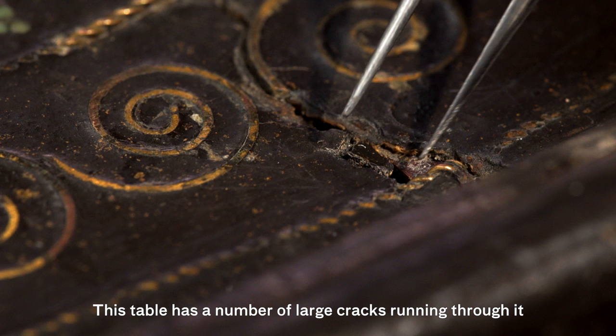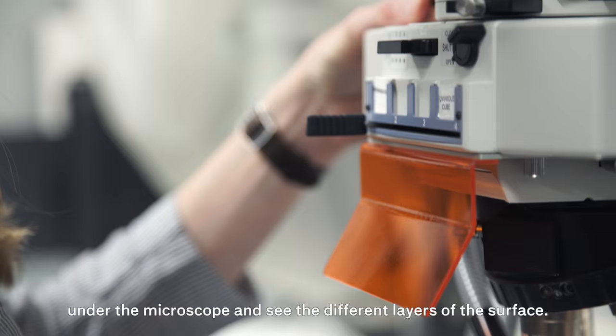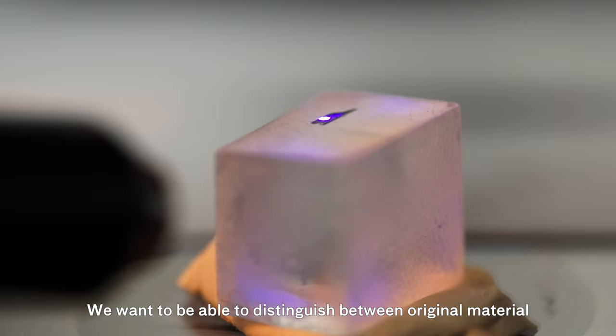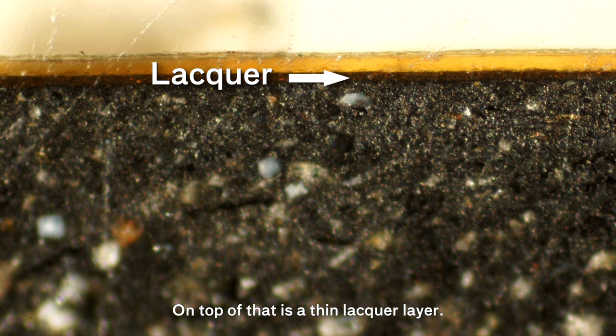This table has a number of large cracks running through it, which are going to give us the opportunity to take some nice samples. With a cross-section sample, we can prepare it and put it under the microscope and see the different layers of the surface. The bulk of this cross-section is the ground layer that's been bulked with crushed animal bone and crushed fired ceramic — those are the larger particles within the dark black layer.